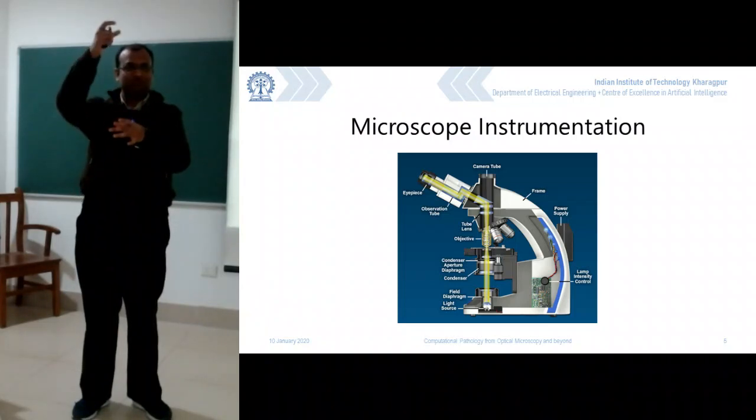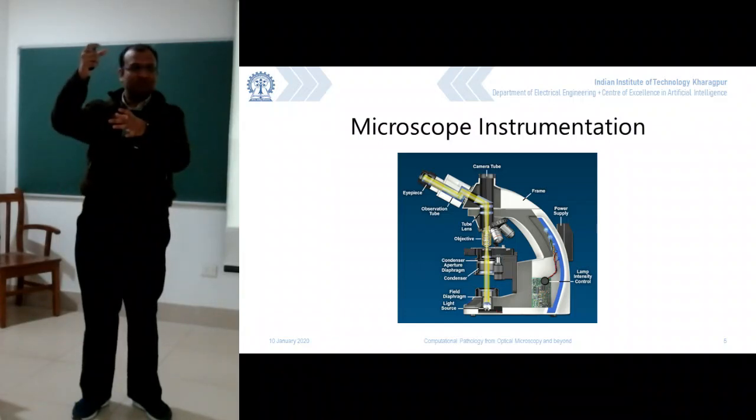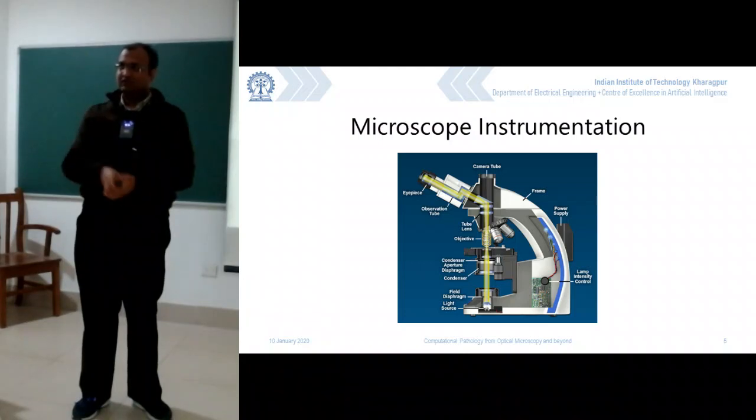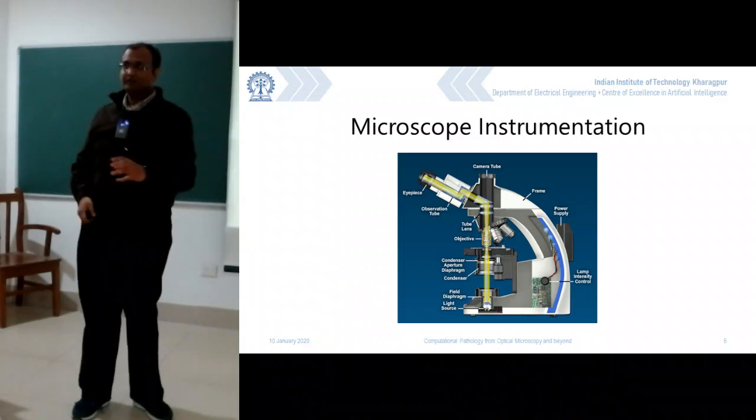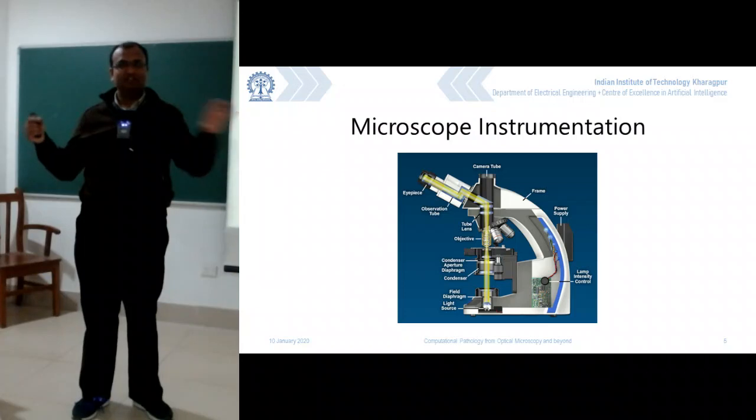pass through this one. So there needs to be some way of concentrating all of this light which was otherwise spreading into a parallel beam. Yes or no? We need to do that. Now the point is, how do we do that? So one simple example, very simple way, and which is what is used over here is, if you have a lens and you have a light source at the exact focus of this convex lens, whatever comes on the other side is basically a parallel beam, and it's from the other way around.